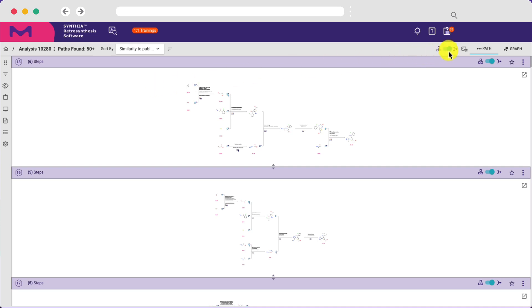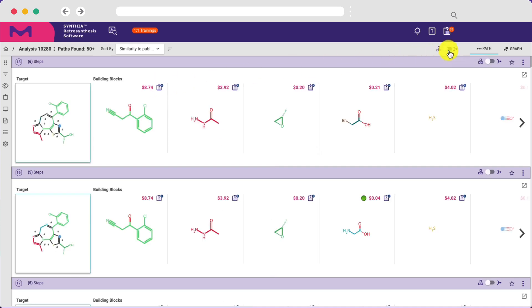For ease of analysis, you can view pathways based on disconnection strategy and required building blocks.